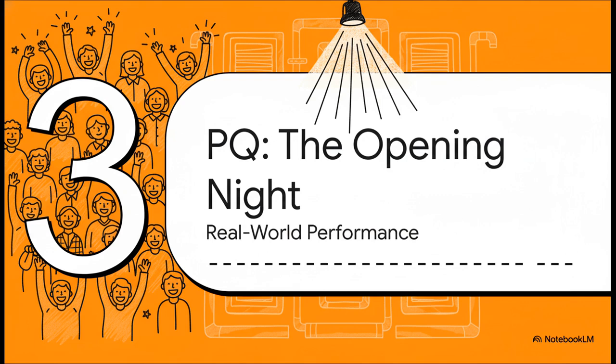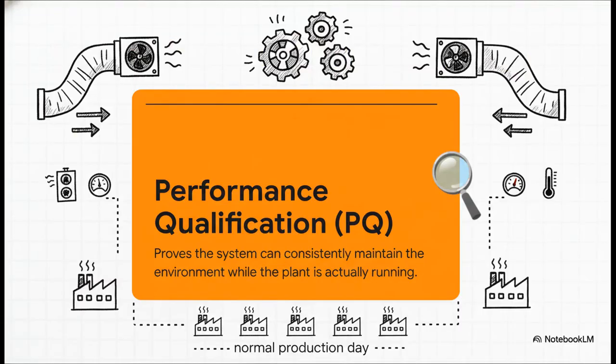So if OQ is the dress rehearsal, then PQ is opening night. It's the live show with a full audience. This is the ultimate real-world test. The whole point of PQ is totally different from OQ.